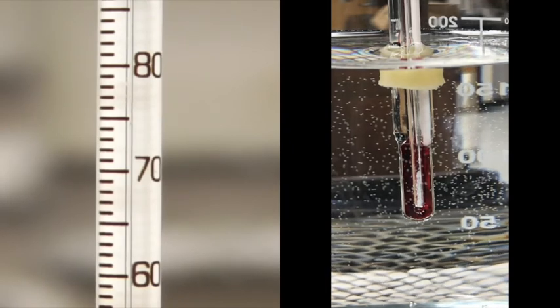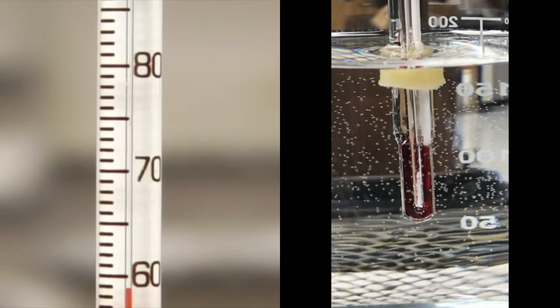Okay, above 55 now, so let it get above 60, and then we're going to slow down the heating a bit. And we can see it coming on the thermometer. We will read that on the camera now.